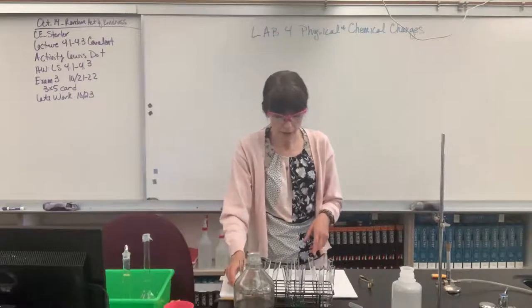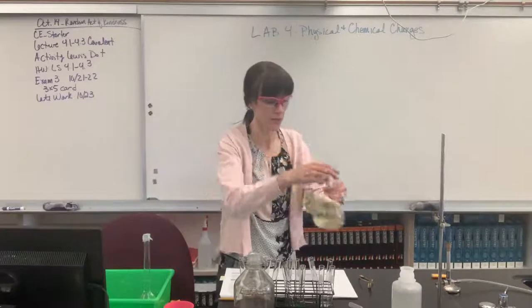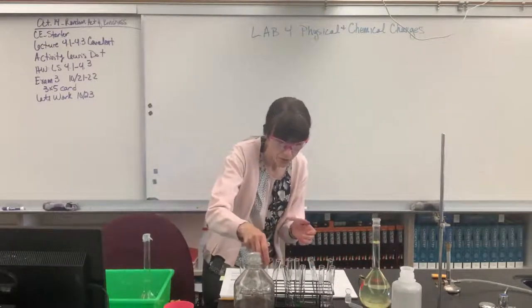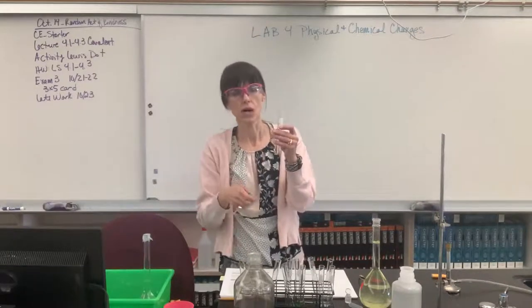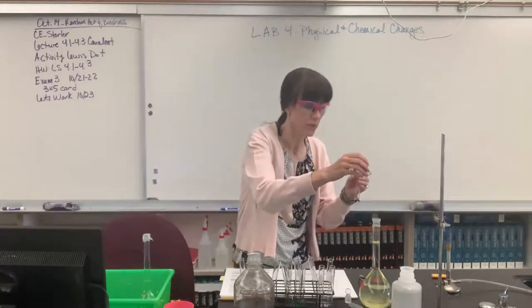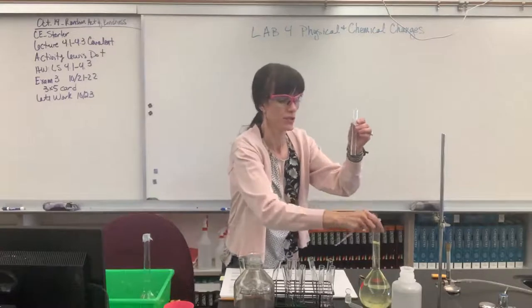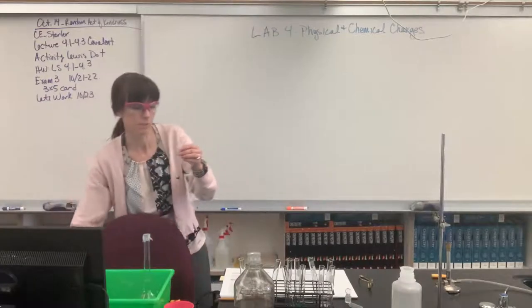That was step 5. Add 2 drops of ammonium thiocyanate. So here is ammonium thiocyanate. I'm going to get another little pipette. And with this test tube, I haven't added anything to this, that's just the iron 3 chloride dissolved in water. Let's add our 2 drops of ammonium thiocyanate. See what happens. Oh, wow, that was awesome. Check that out. I am going to put this one over here. Just don't want to get these mixed up.